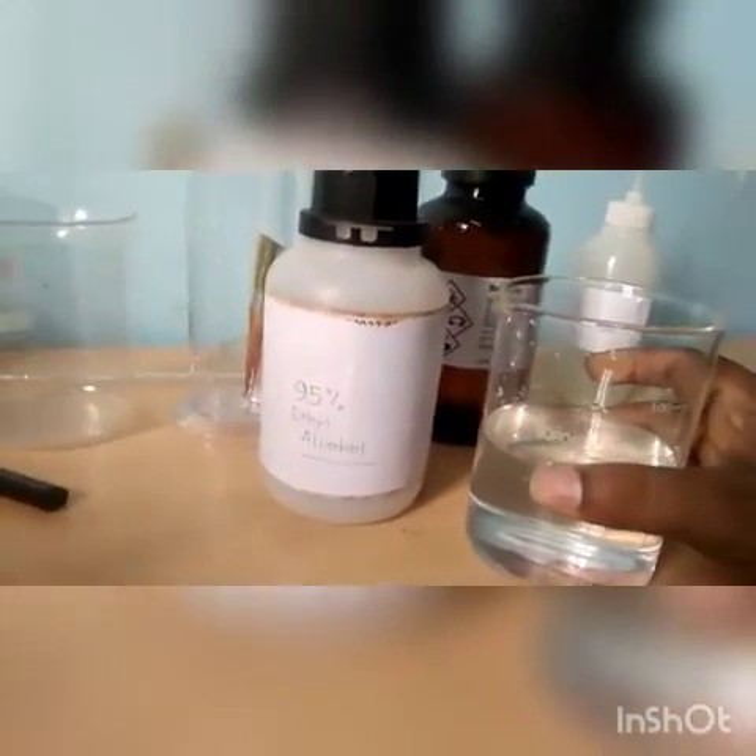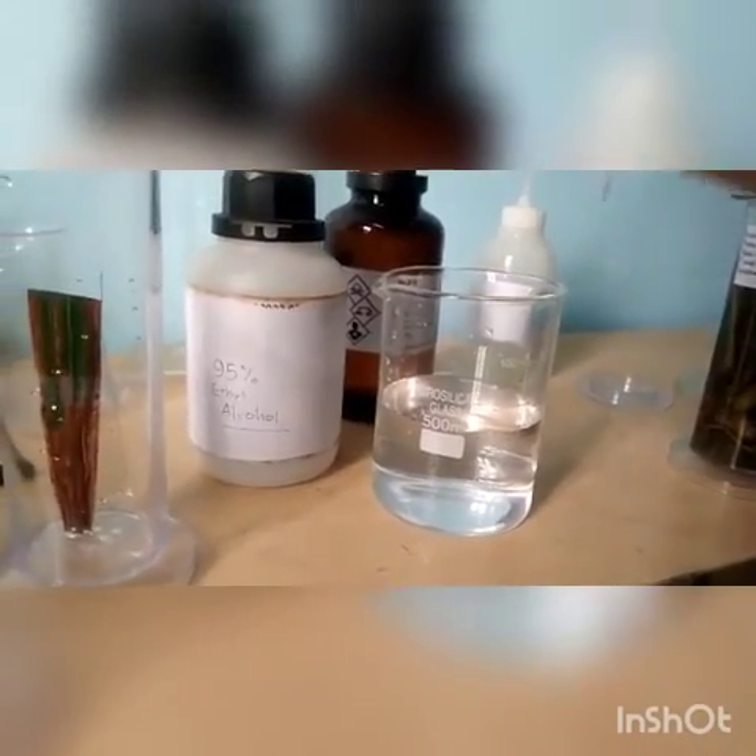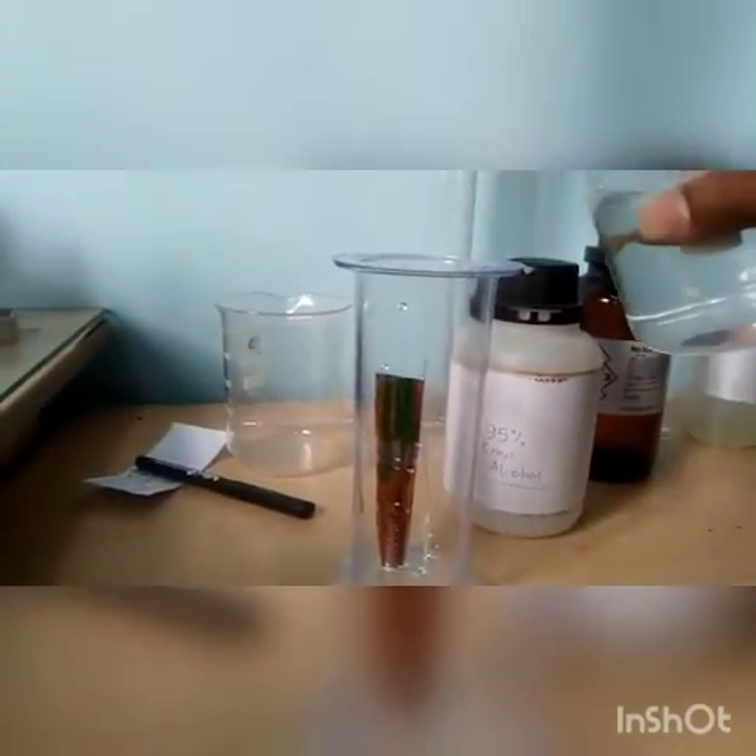We have taken 250 ml of the mixed solution in this beaker. The specimen jar having the sample will be immersed with this solution.